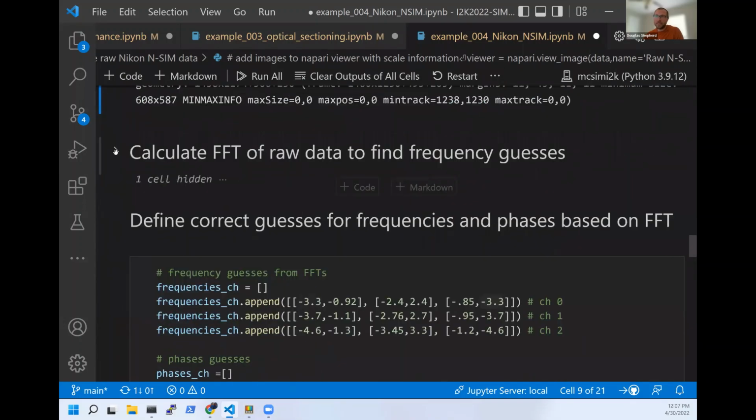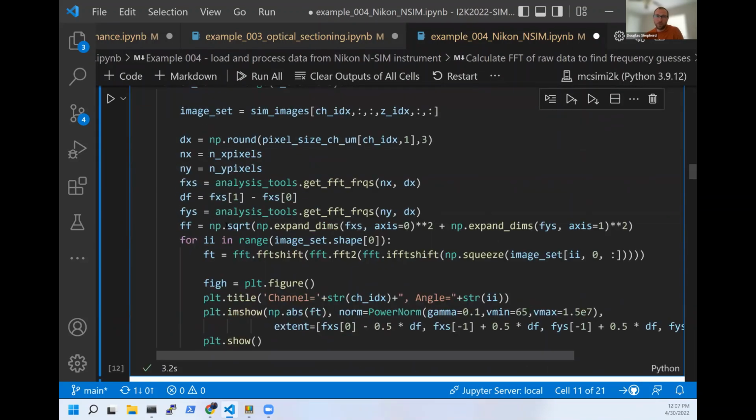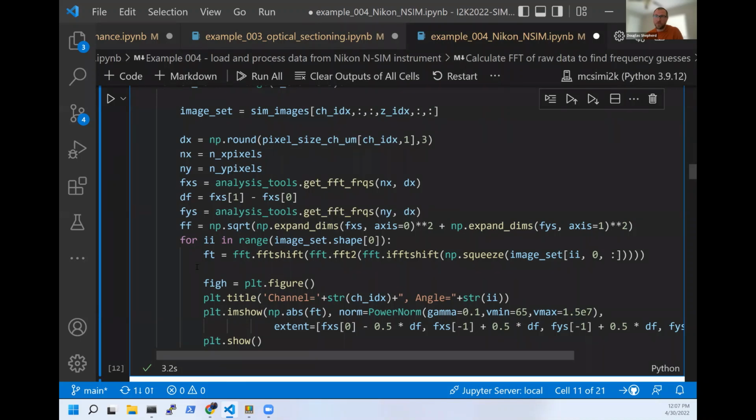Okay, now we can't skip the calibrating it ourselves step. So I'm going to use the same code that I showed you in the previous code blocks, where we grab the data, calculate the correct spatial frequencies for each wavelength, and then plot the Fourier transform. But now we actually need to use it. We can't skip it anymore.